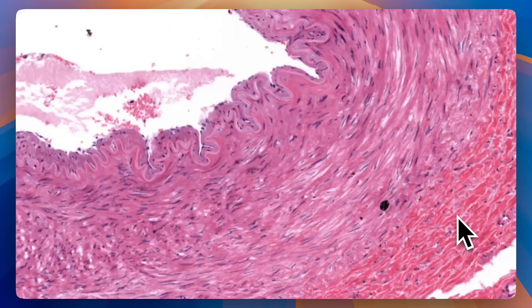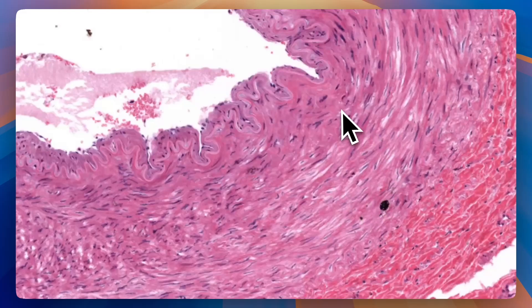They might not jump out at you right away, but if you only see elastic fibers here and here and nowhere else, it's a muscular artery. Muscular arteries are more concerned with being able to constrict and dilate than to stretch and snap, so they don't need a lot of elastin — they do need a lot of smooth muscle, and you'll see that reflected in the structure. The tunica media will be very prominent in smooth muscle cells with very little to no elastic fibers except for the two elastic laminae.